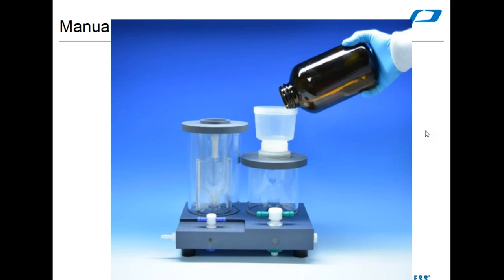Good way to neutralize the waste in a 10 liter carboy before dumping it, pH paper? Or honestly, I would often put a little bit of phenolphthalein in the carboy and add sodium hydroxide solution just until pink. That's usually within the pH parameters for dumping down the sink. You would have to obviously consult your local regulations. Finding some kind of pH indicator in the appropriate range works really well.